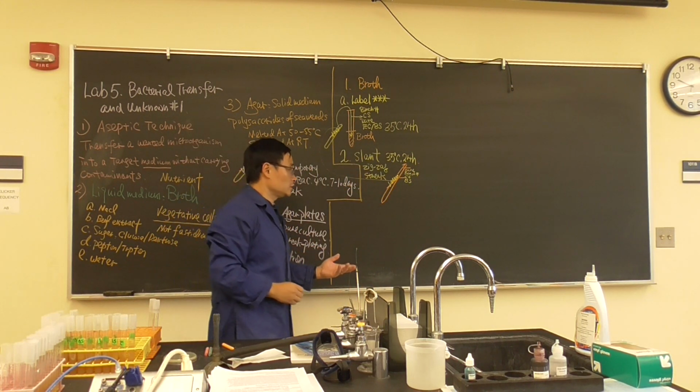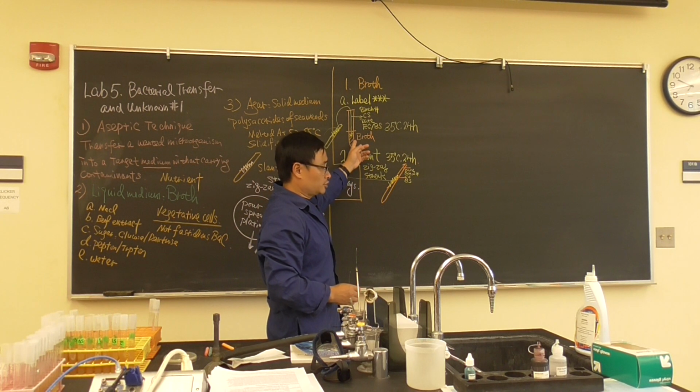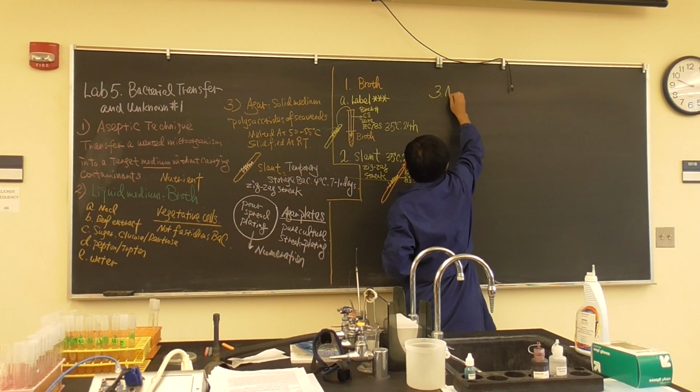We hope to see either turbidity, precipitation, or pellicles for broth. We'll see a very clear zigzag marker for slant. Okay, now the third one is agar plate.